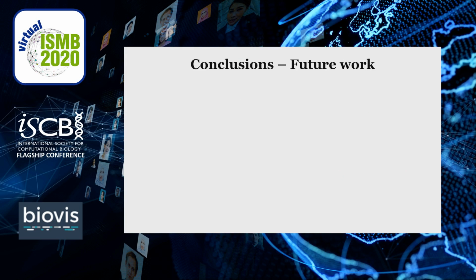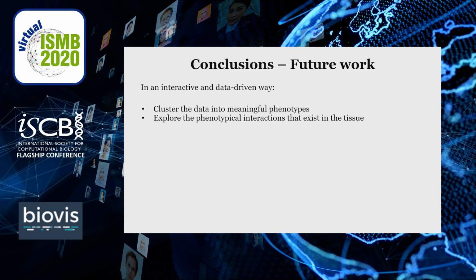Concluding, we have presented the workflow to enable the user in an interactive and data-driven way to precisely identify the cell phenotypes, explore and locate their spatial interactions, and identify subsets of phenotypes with significant spatial interactions.